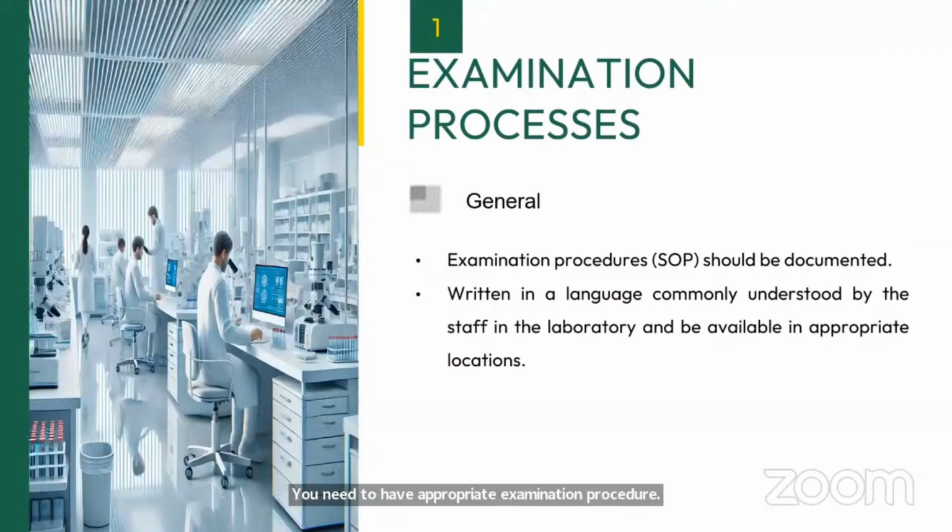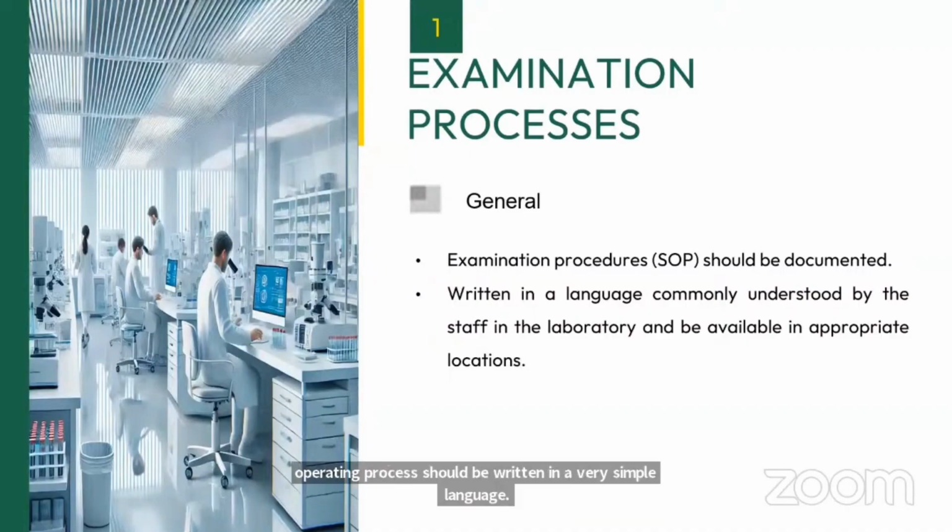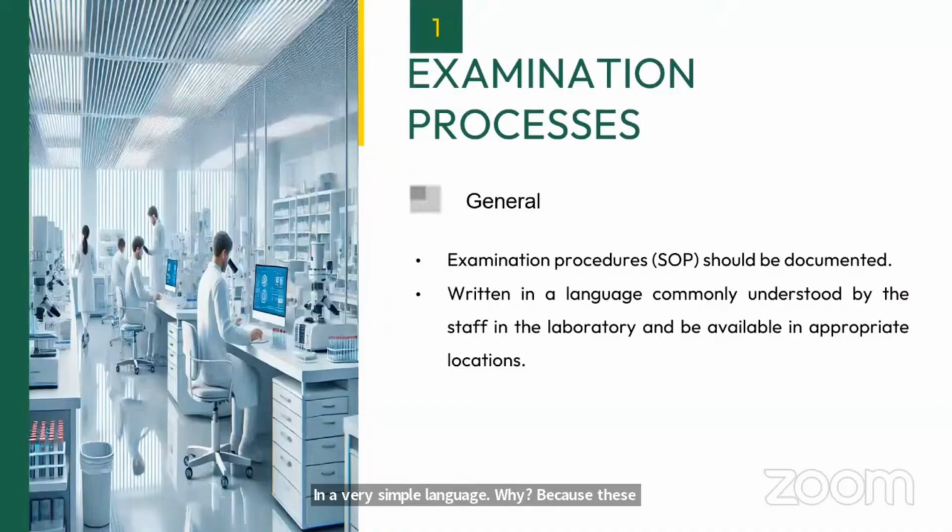The next part: written in a language commonly understood by the staff in the laboratory and available in the appropriate location. Understood by the staff in the laboratory means the standard operating procedure should be written in very simple language. Why? Because these examination procedures are mostly used by the actual workforce of the laboratory, and not necessarily is all this workforce highly educated or highly proficient in English or any other very sophisticated language.